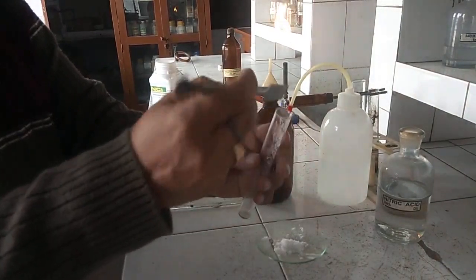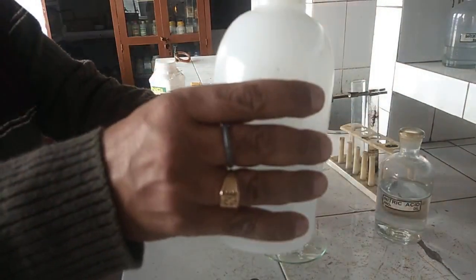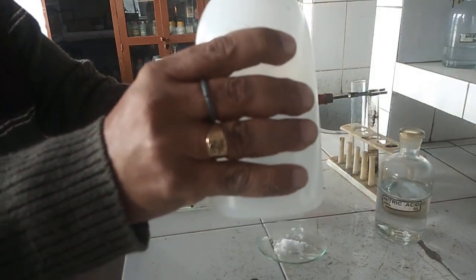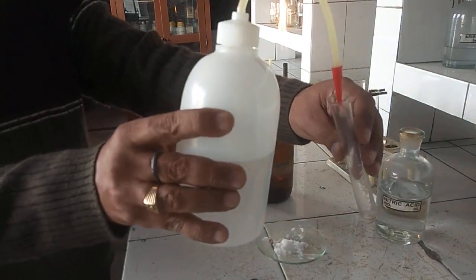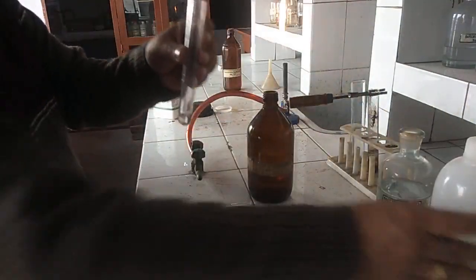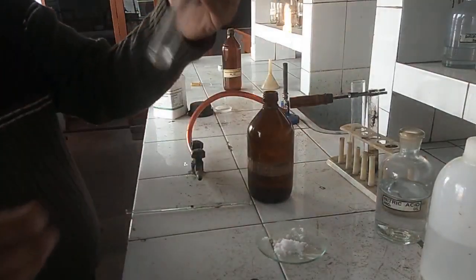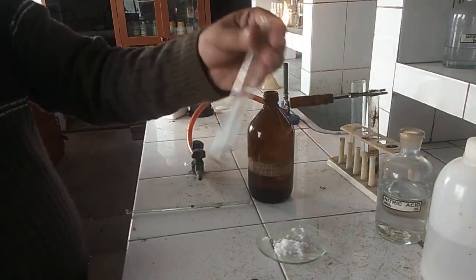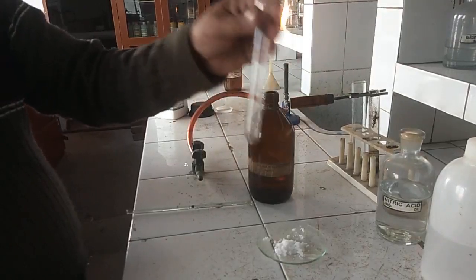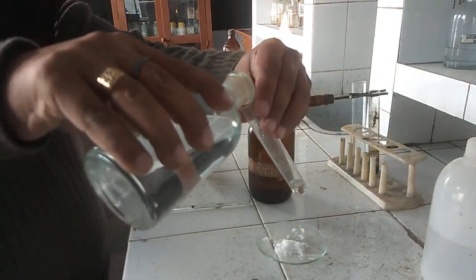We will prepare an aqueous solution of it. For this, we will add distilled water to the test tube. We will not use tap water for this because tap water also contains chloride ions. So we will prepare the aqueous solution of the salt in distilled water. Now we will acidify this solution with the help of dilute HNO3.